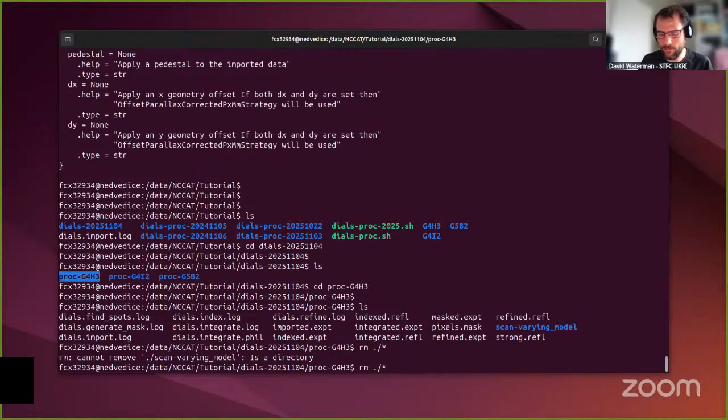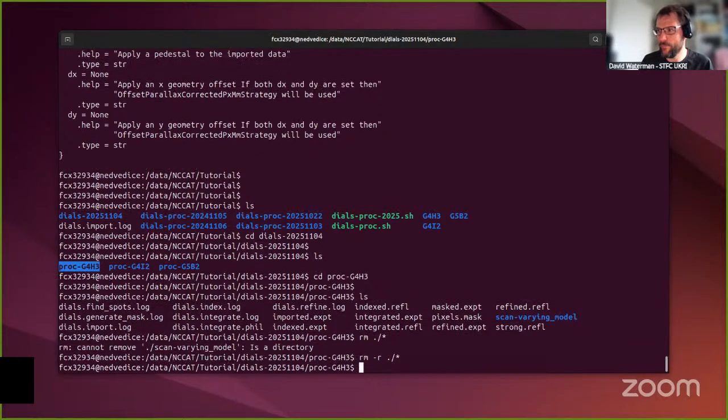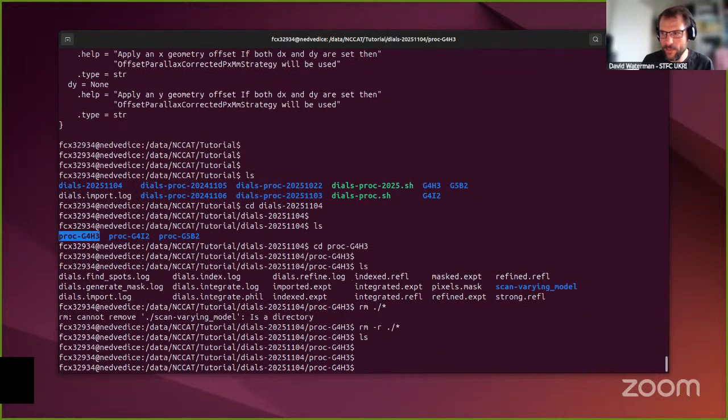Okay, so right, that's now an empty directory. Now, there's a description in the tutorial document that explains that reading this image format requires an extra step. I'm just going to show what happens if you try to import the images without doing that.